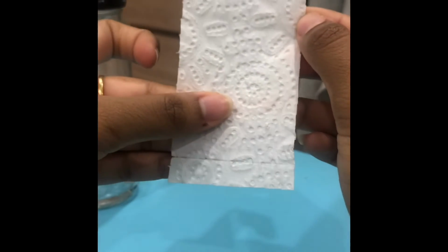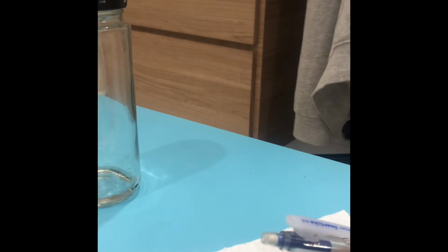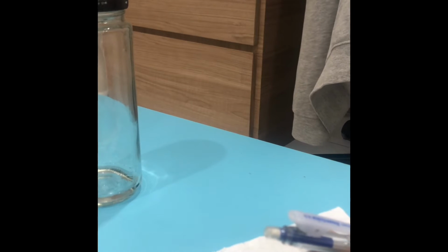Okay, so this is the first line. It's a very light line I've marked. Now I'll be moving on to marking from the 1 centimeter line. I'll be measuring another 5 cm and marking that.